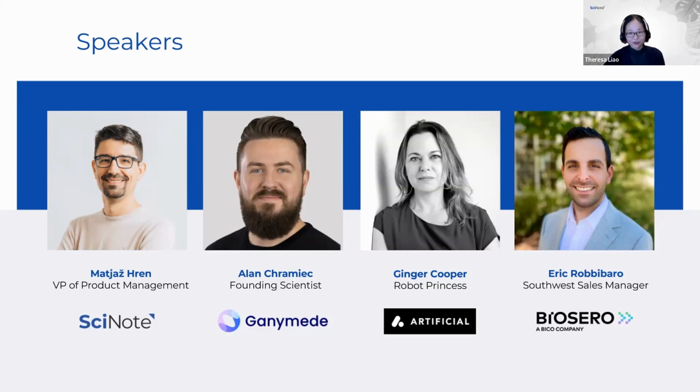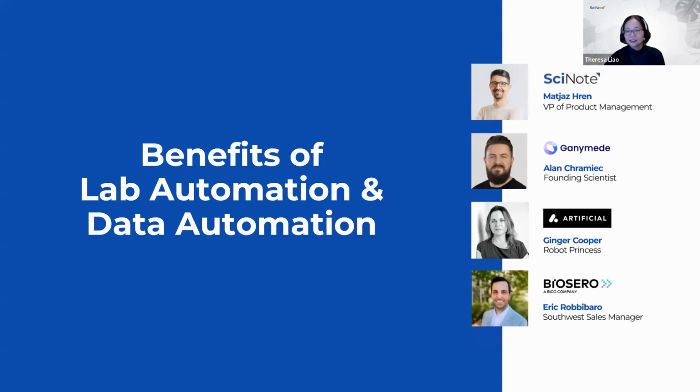So we're going to start with a question on automation, which is, when I first started planning this webinar, Elle and I had a little discussion about lab automation and data automation. So I want to start with defining it a little bit better and talk about their benefits. So exactly what are these two automations? Where do they overlap? What exactly do they cover? And what kind of benefits do we usually see when it comes to automation?